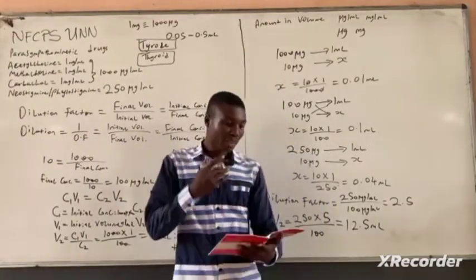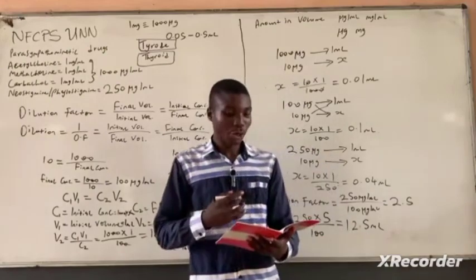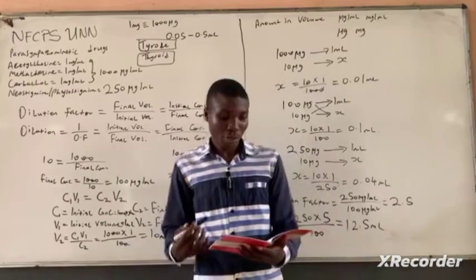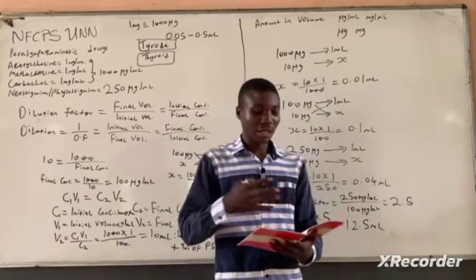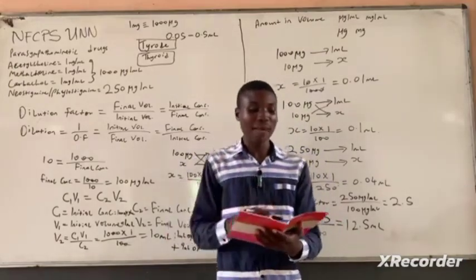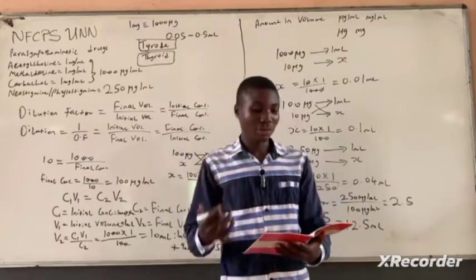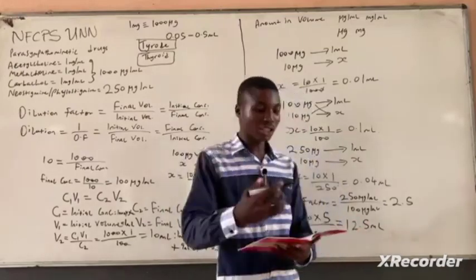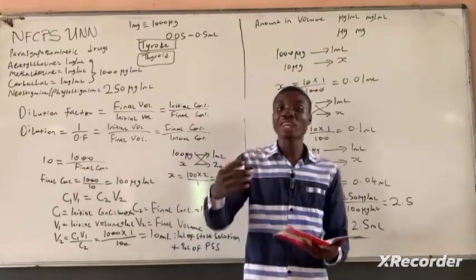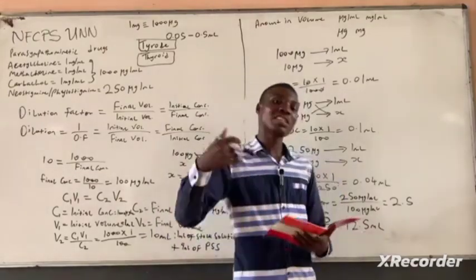Now, this part talks about having 3 test tubes. In the 3 test tubes, you have 20 microgram of acetylcholine in 0.4 ml. In the first test tube, you are adding 3 drops of blood plus 0.1 ml saline. Second test tube, you are adding 3 drops of blood and then 10 microgram of physostigmine. Third test tube, you are adding 3 drops of saline and then 0.1 ml saline. Then you are incubating the 3 of them at 37 degrees Celsius for 30 minutes, and then you're administering those contents separately to the tissue.